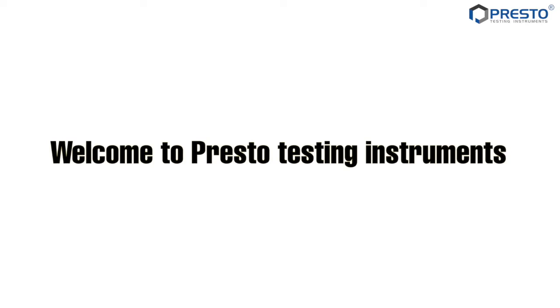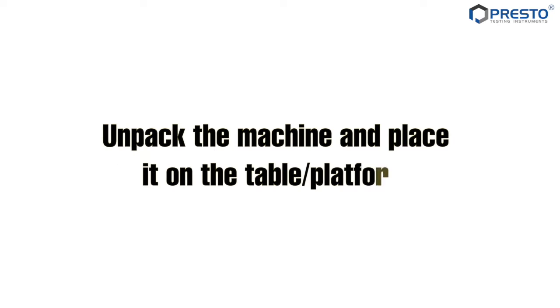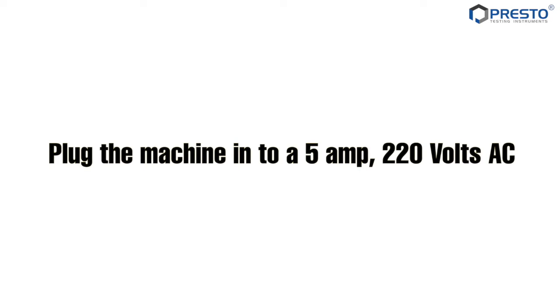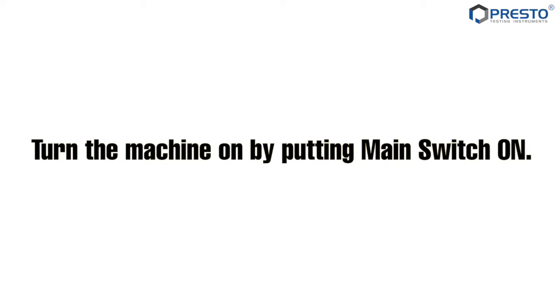Welcome to Presto Testing Instruments. Peel, seal, bond adhesion tester. Unpack the machine and place it on the table platform. Plug the machine into a 5 ampere, 220 volt AC. Turn the machine on by putting the main switch on.